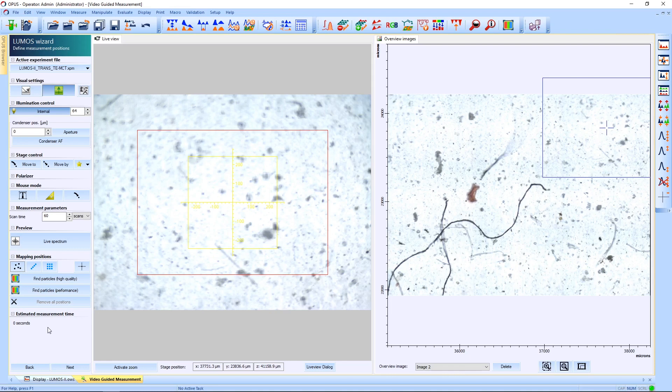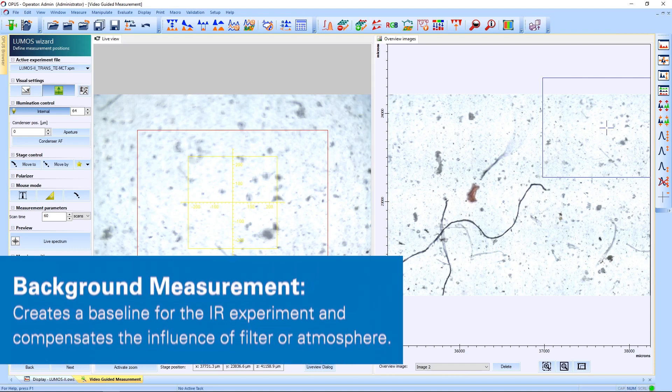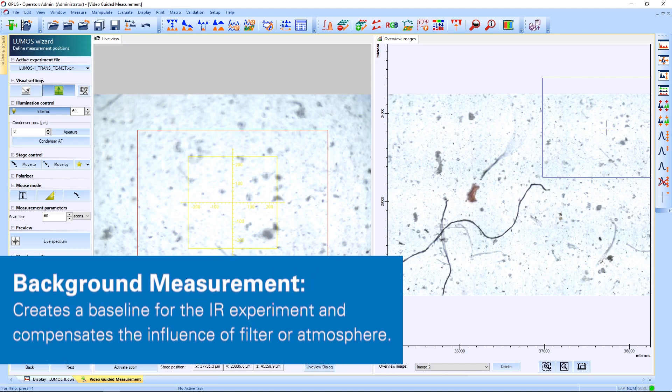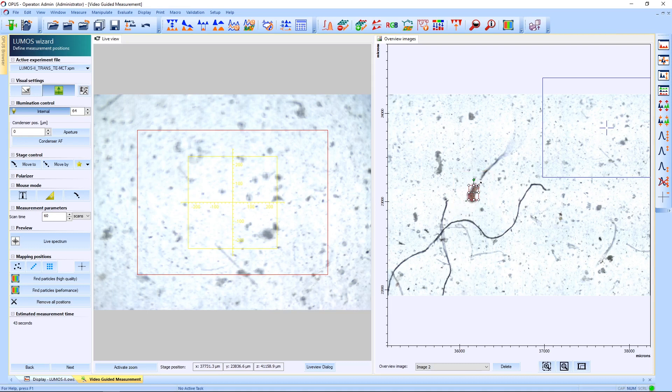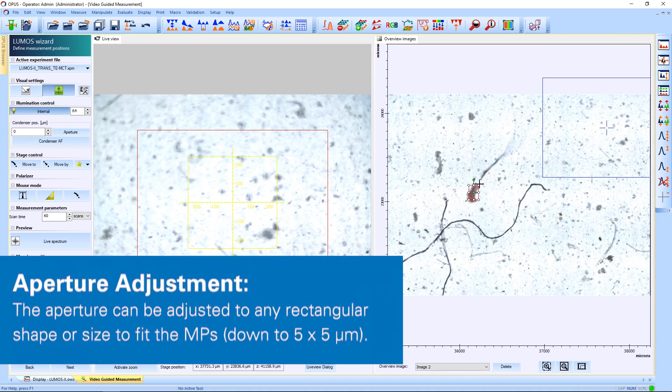Now we have selected the TE MCT and already collected a background, and now we need to set measurement points on our particles. We can either do this manually by just clicking on them and adjusting the aperture in size, as well as in rotation to exclude any information from the background.